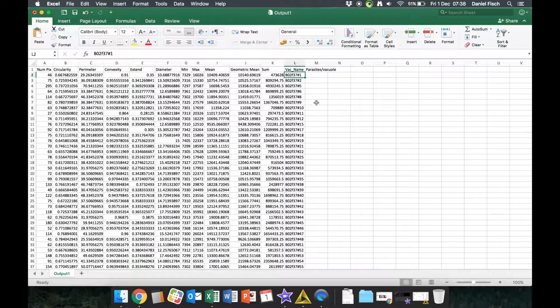So the way these things are named is that this is the field name. So the field we imaged in our first couple of images was in well B2 and field 37, and then this would be the first vacuole, this would be the second, this would be the fifth, sixth, eighth, ninth, and so on. The reason why these numbers are not continuous is that probably vacuole 3 and 4 were just some artifacts that were filtered out and do not actually represent Toxoplasma, but they were still picked up by the pipeline before the filtering.